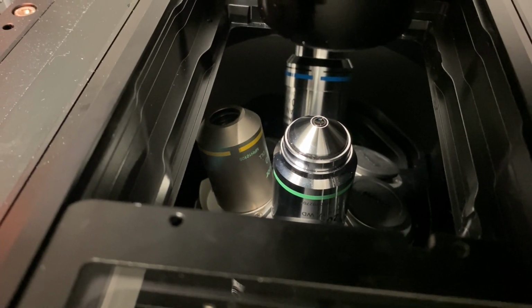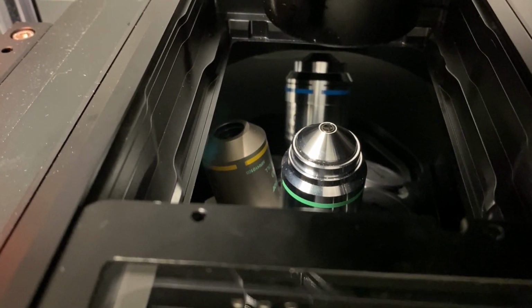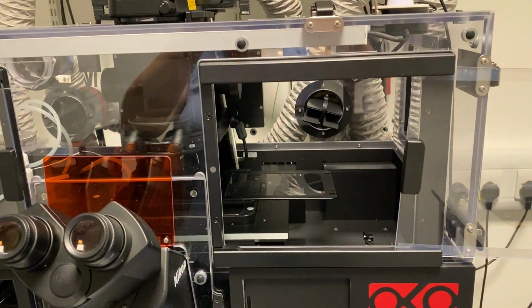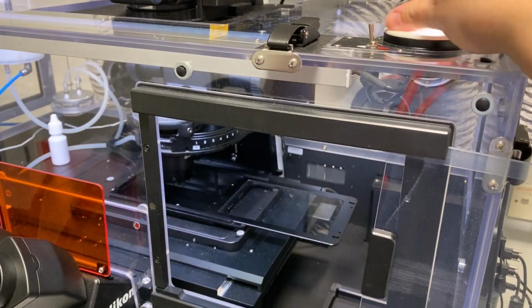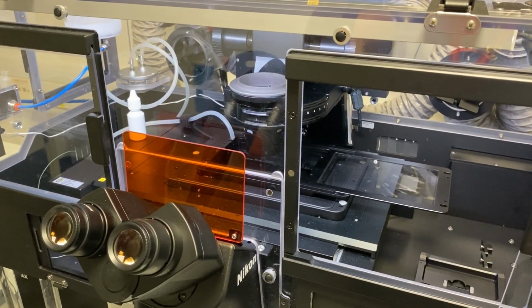If you see any scratches, dents, cracks, please let us know straight away at the beginning of your session. If it's too dark, you can switch on the box light by pressing the foot pedal, and the box light should come on. If it doesn't, try the dimmer switch. Someone might have used the dimmer switch. So you want to check all the lenses you'll be using.